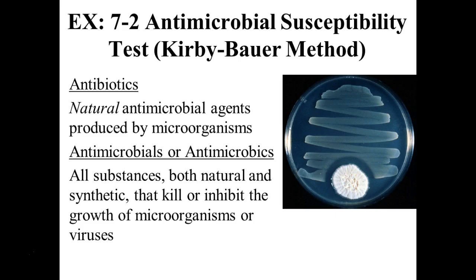Now, does it always work? No, what did we see today? We saw some resistance, right? We saw that penicillin had no effect on E. coli, right? E. coli, like, laughed at that stuff. You know, you were probably like, well, was there any penicillin in that disc, right? Did we put an old disc on the plate? No, it comes out that way every semester. It's because of the differences between these organisms. And that's why sometimes one antibiotic will work and one will not. It depends on what bacteria you're dealing with, right?